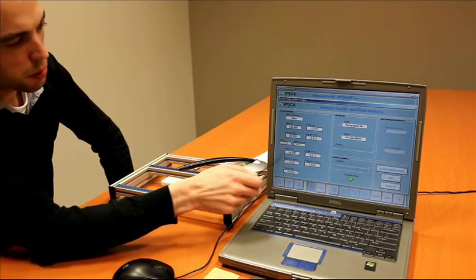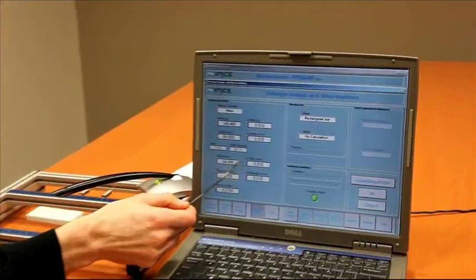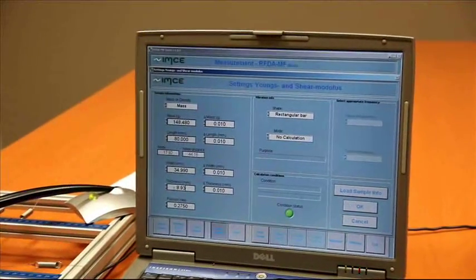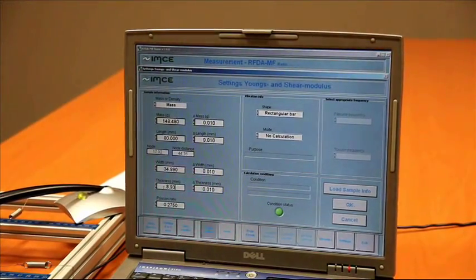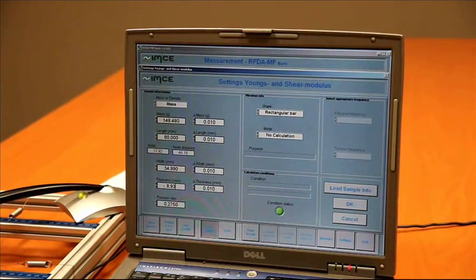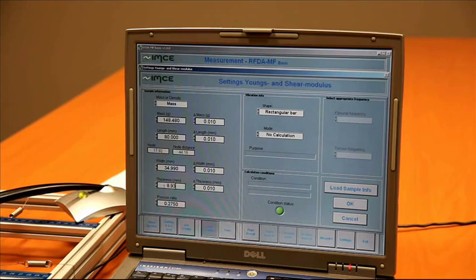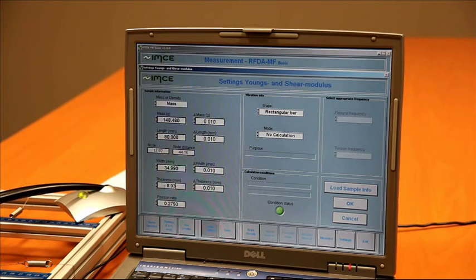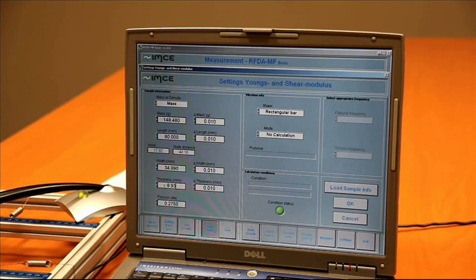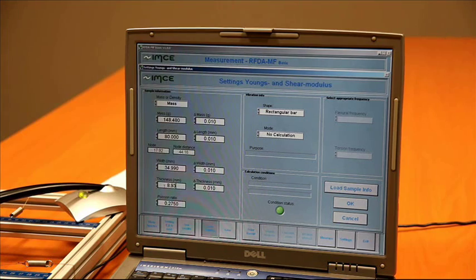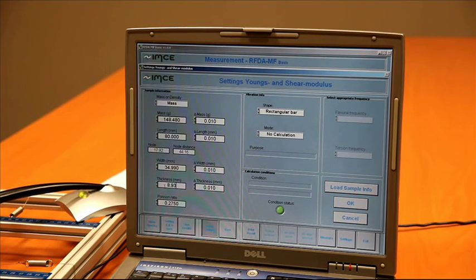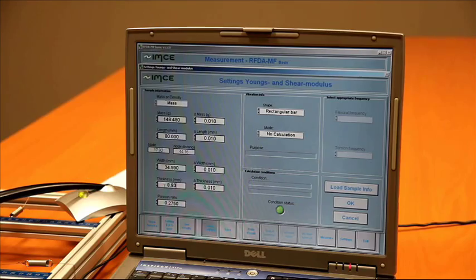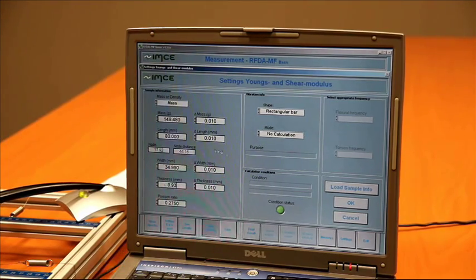In the screen we also see the load distance. That's the distance between the two support wires, and it's important that the sample is supported in this way because this way it's supported in the vibration nodes of the flexural vibration which we are going to measure.